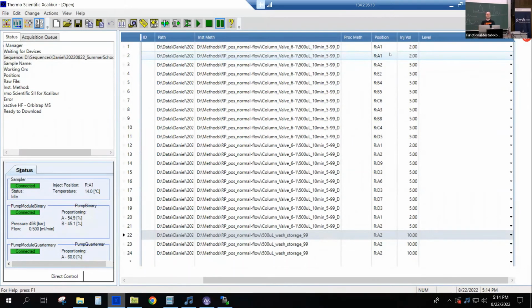When you said, for example, the HCMS method, but you also have to set it in the tune method, do you know which of them it will take? Yeah. So the settings here in your method overrule the tune method. Okay. I think in the older versions you could only set it in the tune method, also the micro scans, but now conveniently they have brought it into the Excalibur methods too.